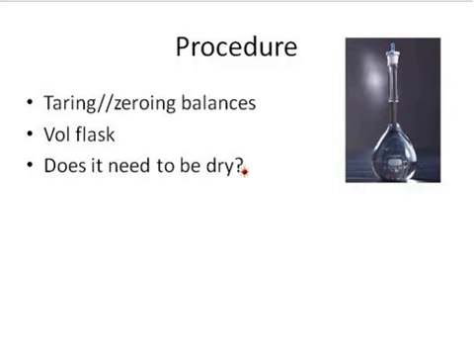Okay, so hopefully you'll see that and kind of understand it when you get into the lab. So be careful about using the volumetric flasks, and you will get very nice, accurate results.